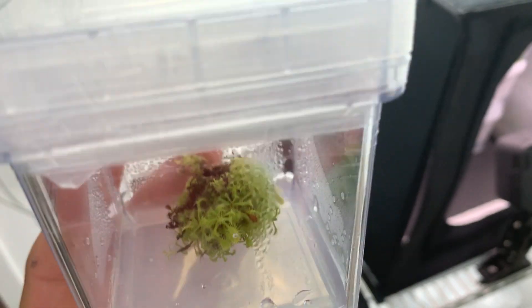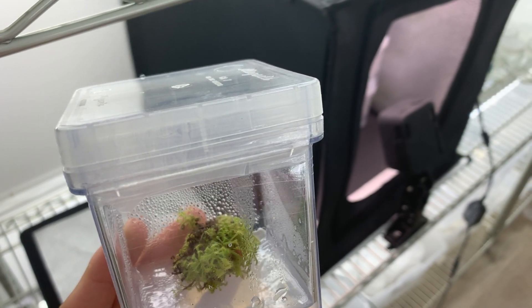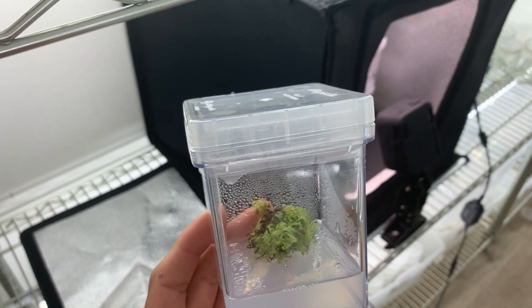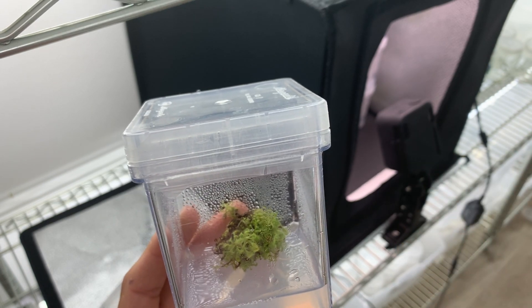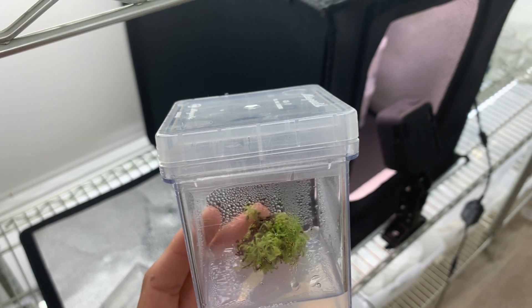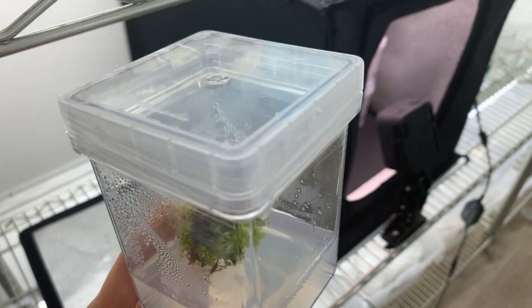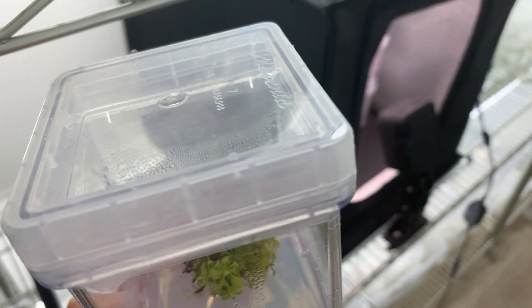I think that's pretty much everything. I still want to keep the plants growing in the light box — I still have a time-lapse camera running and more plants growing in there for another experiment. I want to put the magenta boxes back and let them record for maybe another month or so, until they either get contaminated or the plants completely take over the magenta boxes.